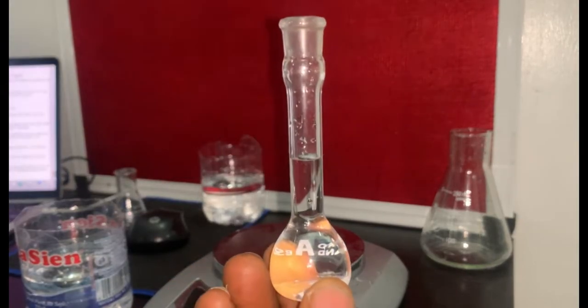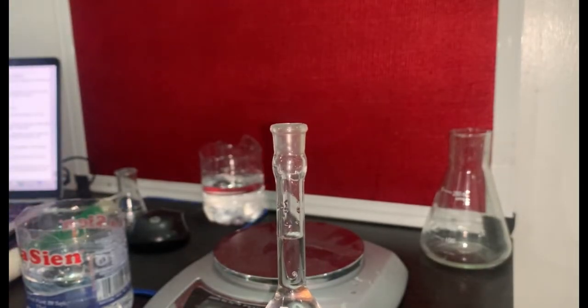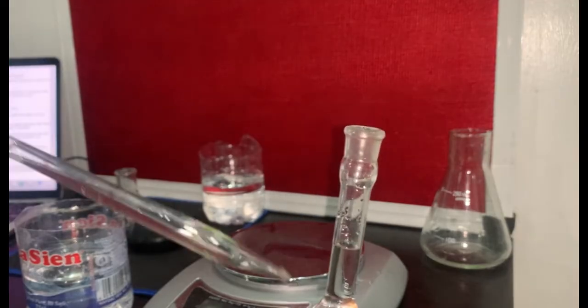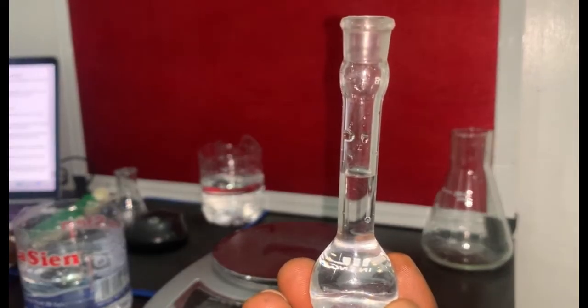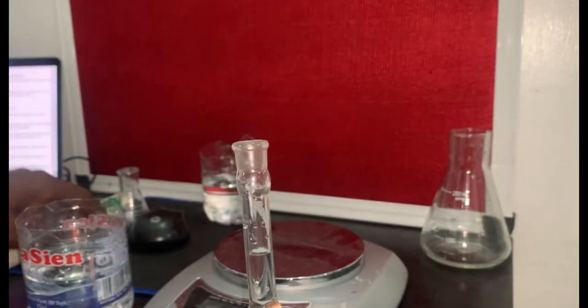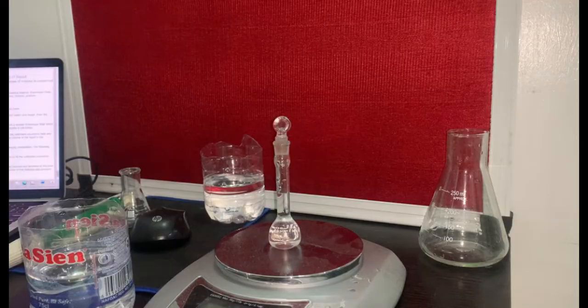All right, so that is it. Exactly at the mark point, which is this place. If I bend it. Okay, so I'll cover this. I'll have to cover it. I've covered it. I'll place it on my weighing balance.